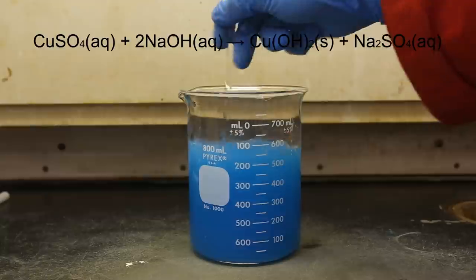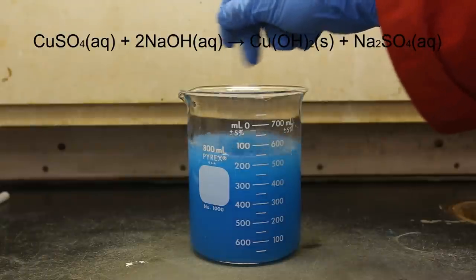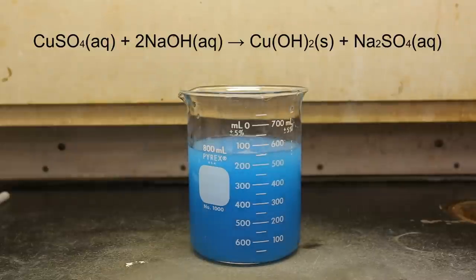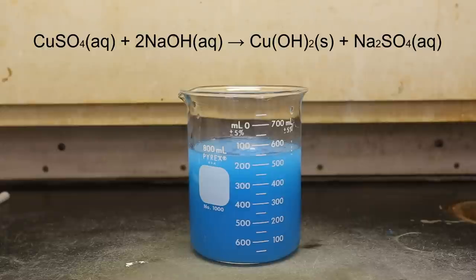This reaction is a double displacement reaction and the overall reaction can be seen above. In the solution, the copper sulfate and the sodium hydroxide are split up into their respective ions. All the ions are floating around in solution and this allows for the copper ions to recombine with the hydroxide ions. This forms the insoluble copper hydroxide solid which precipitates out of solution.